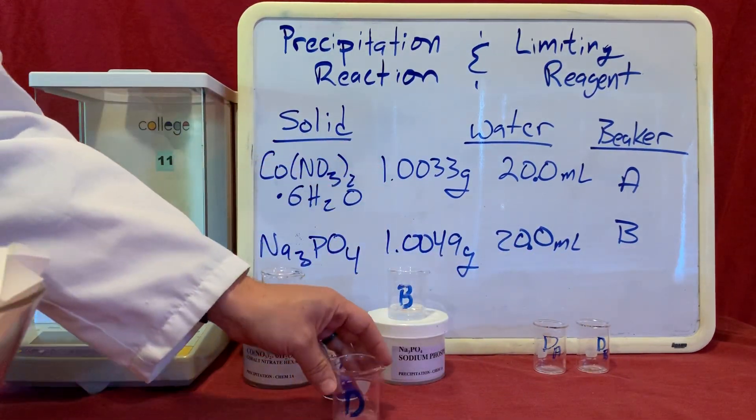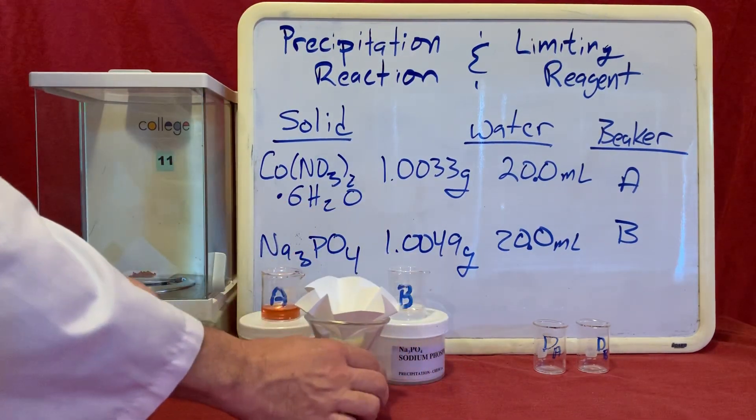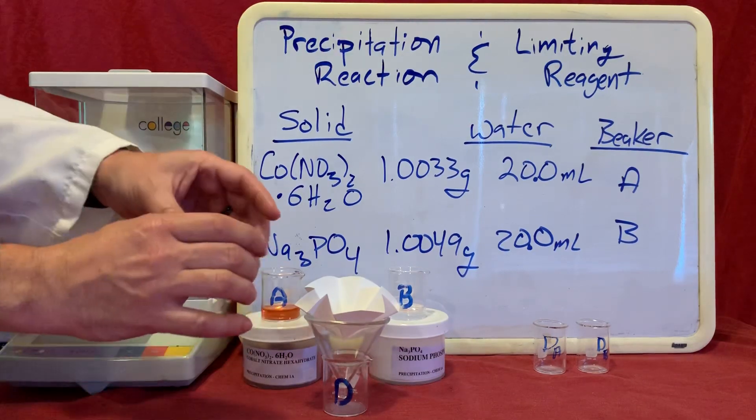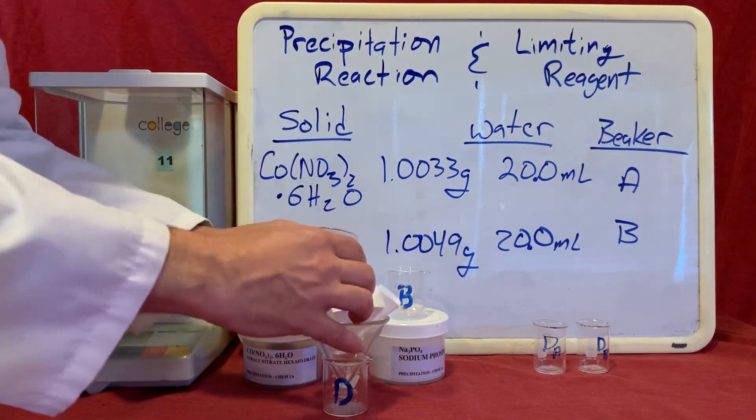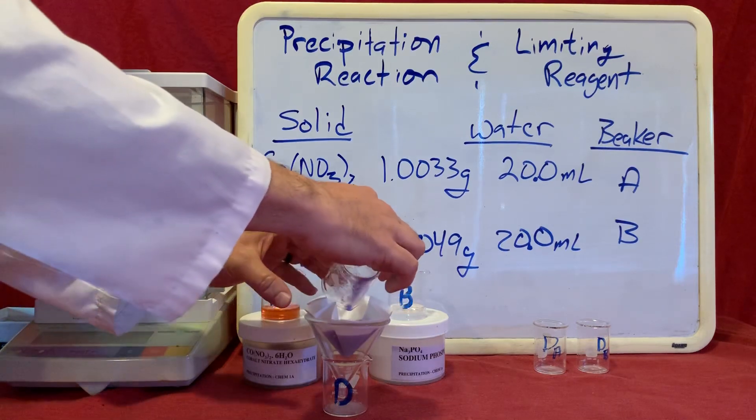Beaker D is going to collect our supernatant, the liquid portion of our mixture. So I'm just going to take beaker C and pour it into my filter paper.